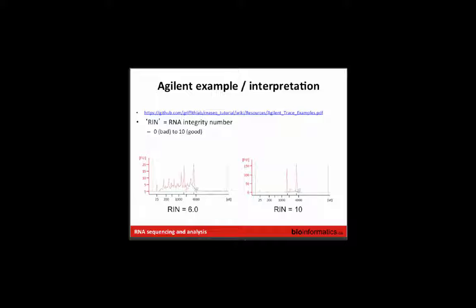Yeah, that's a good point. I think we're going to show a picture of it, but one of the following steps after you isolate RNA is often to fragment it, so maybe we don't care. And to some degree that is true. There are a few gotchas. One is the one I just mentioned about doing a poly-A selection. If you have degraded RNA, then you probably don't want to do the poly-A selection because you're going to introduce a bias towards things that are close to the polyadenylated end of transcripts.